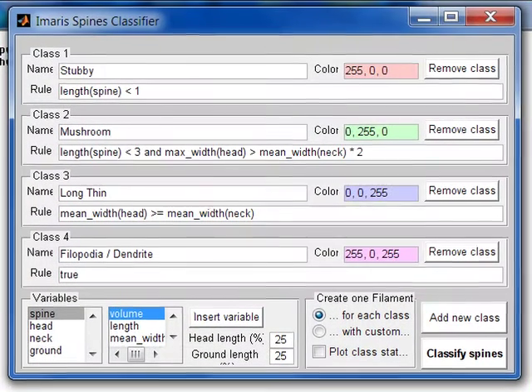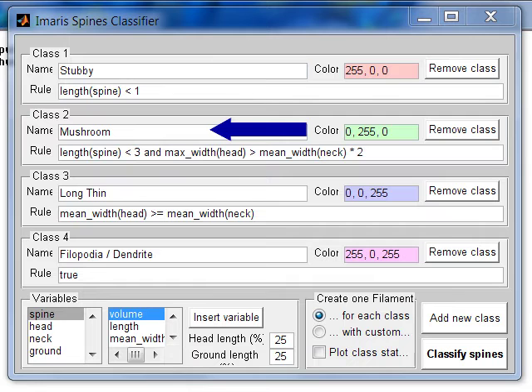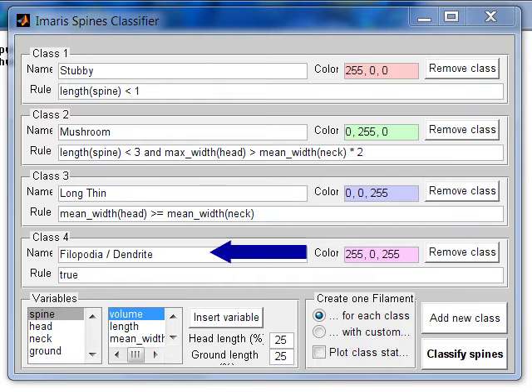In MATLAB, the spine classifier window displays a list of all the default classes. Each class is identified by name, classification rule, and colour. There are four default classes: stubby, mushroom, long-thin, and filopodial.